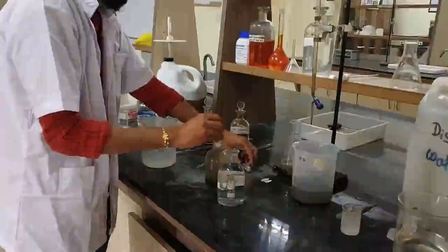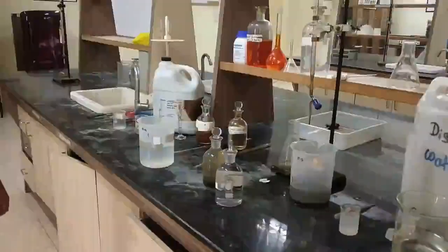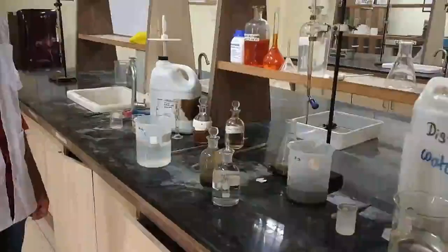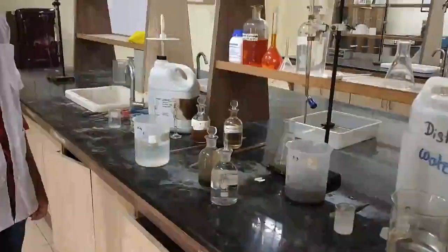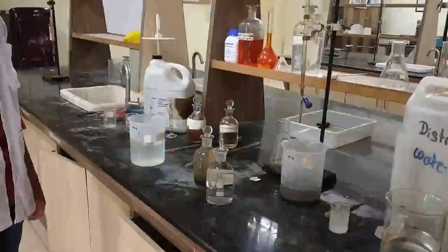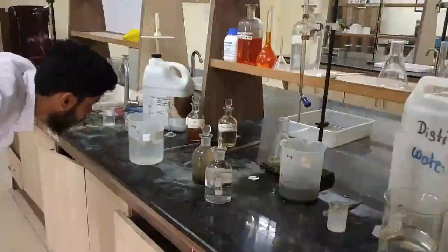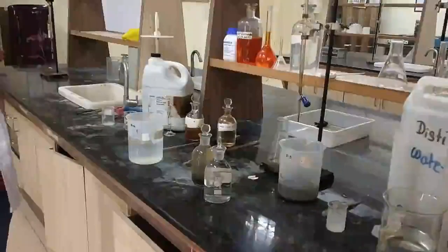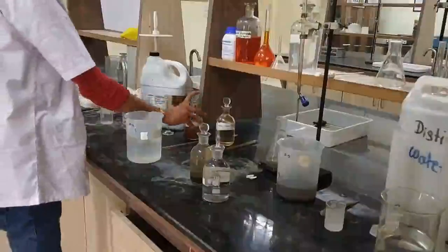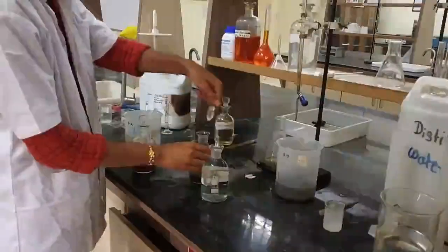Alright. So now what we are going to do is we haven't fixed the DO at site, right? The samples were collected from tap, and this was a laboratory made sample with a very high organic concentration. So we are going to fix the DO, and the DO is fixed with the help of 2 ml of manganese sulfate and 2 ml of alkali iodide azide. So using two separate pipettes, we are going to firstly add manganese sulfate in both of these BOD bottles, and then we'll be adding the alkali iodide azide.